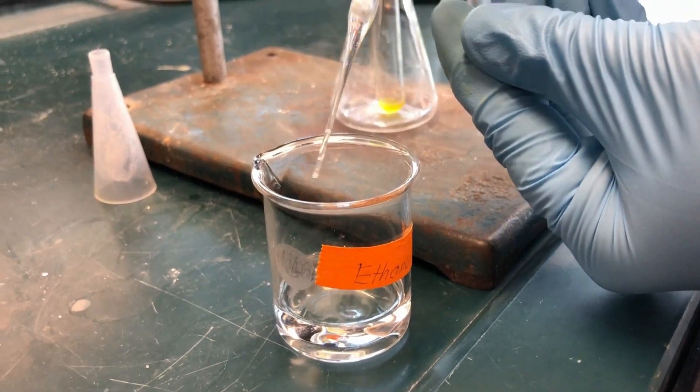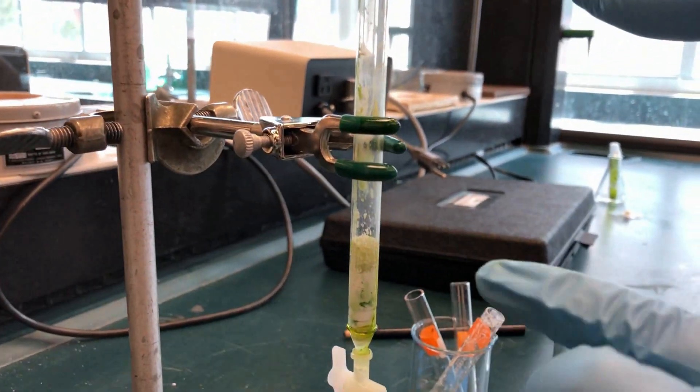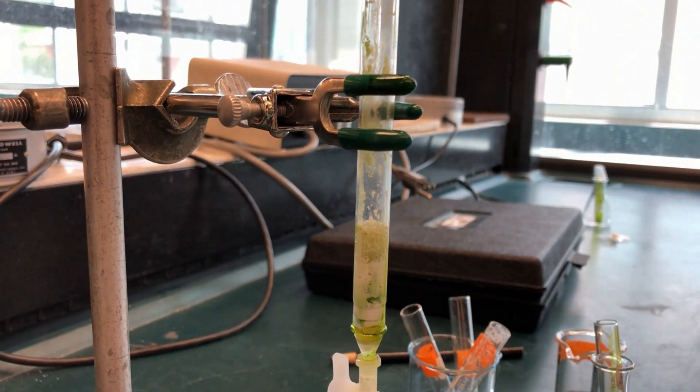If the green band does not move, change to the more polar solvent ethanol. We add ethanol to move the green band down.